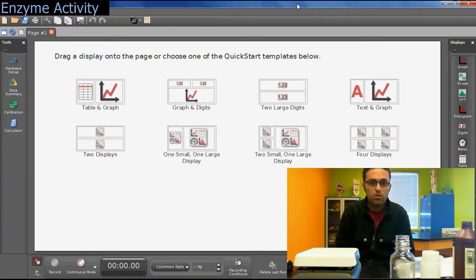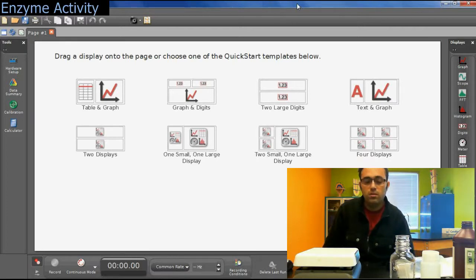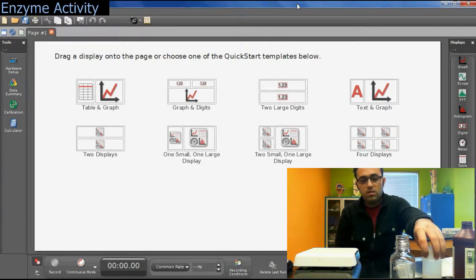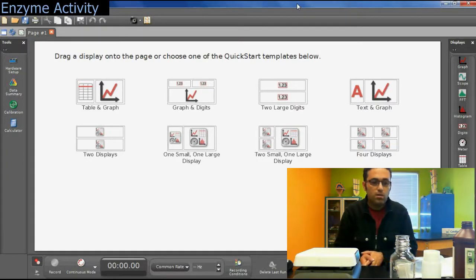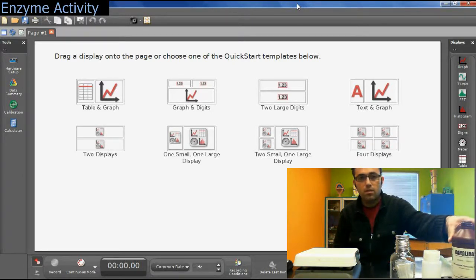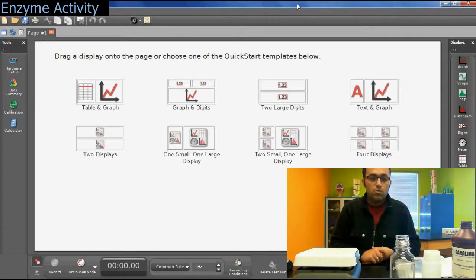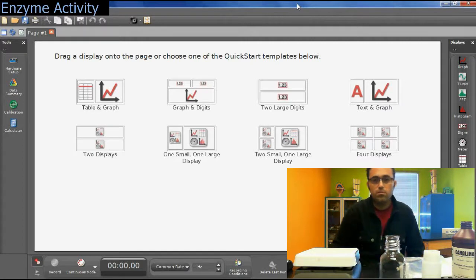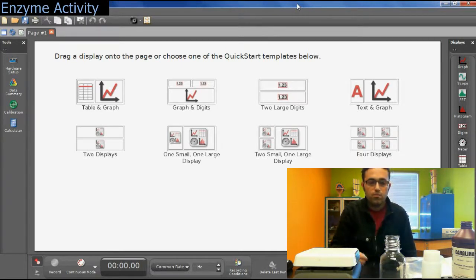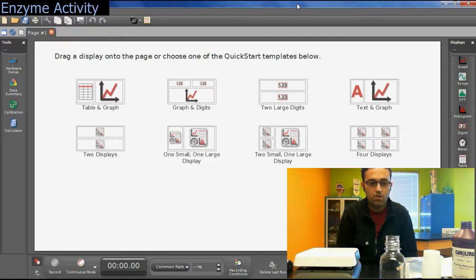You're going to use oxygen sensors to measure the enzyme activity. The enzyme is derived from yeast. Yeast cells are used as the catalyst source. I have prepared a yeast suspension here at about 14% mass per volume, and I have hydrogen peroxide here at 3%.